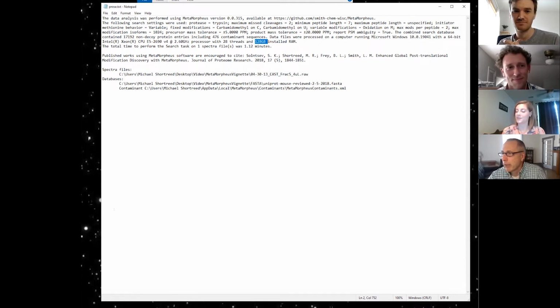You can run it in human time. You can certainly search files faster than you can take them, but it's not crazy fast. It's human fast. Our good friends at Michigan with MSFragger are at the next level with speed, but this is a perfectly reasonable response time.